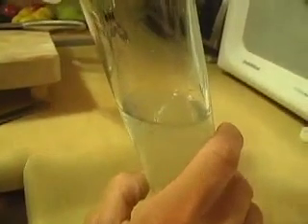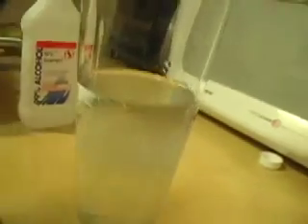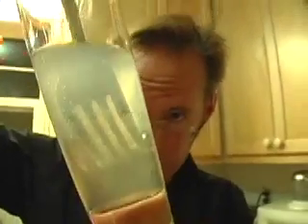That is cool — you see all that stuff falling out? All that stringy looking stuff — that's DNA. That's all the instructions to make a brand new onion.